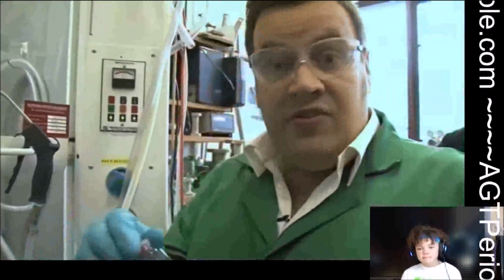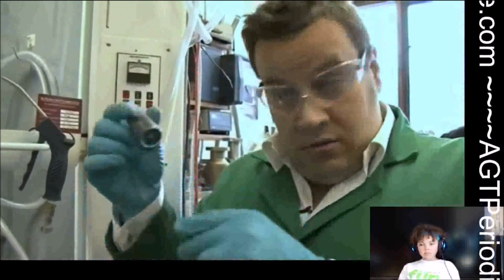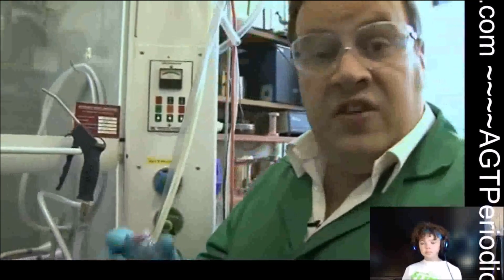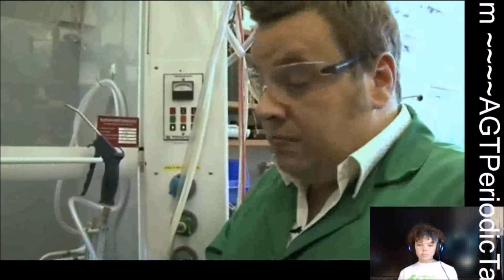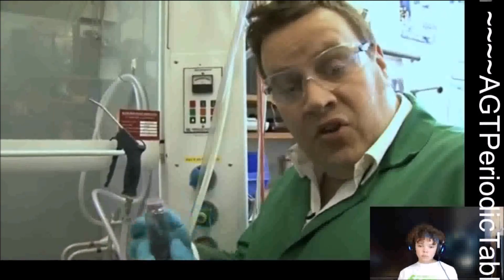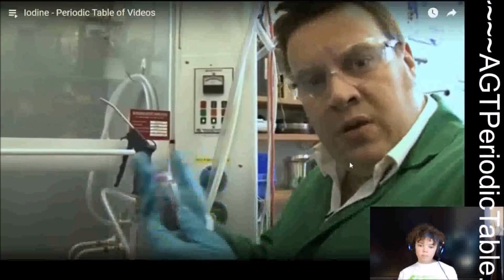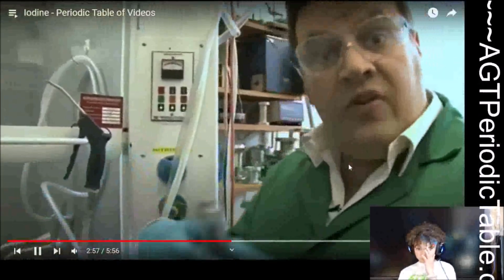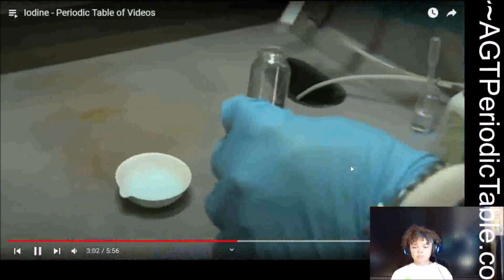So what we're going to do is mix it now with another element, and that element is aluminium. So aluminium has electrons to give away. Iodine's going to nab them. You're going to see some oxidation chemistry and the formation of a new compound, which is aluminium triiodide. It's a really nice chemical reaction. But the way that we do it is we mix the two together, and then we have to add water, which acts a bit like a solvent, but also the oxygen in the water activates the iodine so that it becomes more strongly oxidizing, and then hopefully we'll see the new reaction. So I'm just going to put some out into this small vessel.